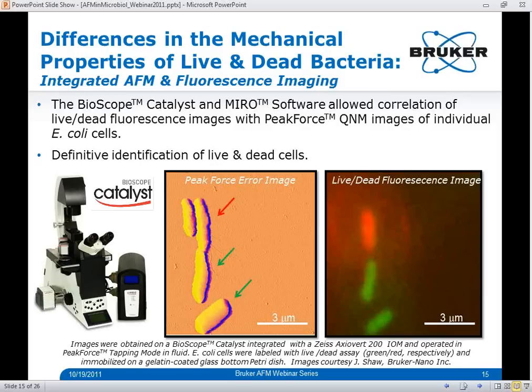To examine differences in the mechanical properties of live and dead bacteria cells, the BioScope Catalyst was operated in Peak Force Tapping mode while Miro was used to register epifluorescence images to the AFM images. Bacteria were labeled with a fluorescent live/dead assay: live bacteria were labeled with the membrane-permeant dye CYTO9, which fluoresces green, while dead bacteria were labeled with propidium iodide, a membrane-impermeant dye that fluoresces red — only dead cells with a compromised membrane are labeled with the red fluorophore. In the peak force error image, one cannot easily distinguish alive from dead cells by AFM topography alone; however, with the Miro-registered fluorescent images as overlay, the red fluorescing dead cell at the top of the image is clearly identified from the two live green cells at the bottom.